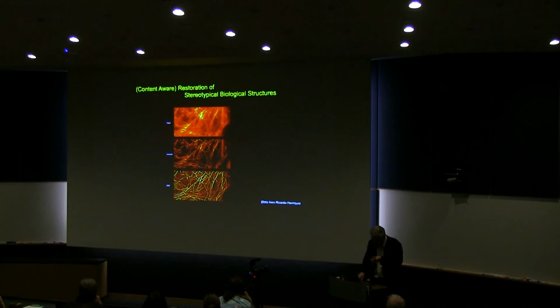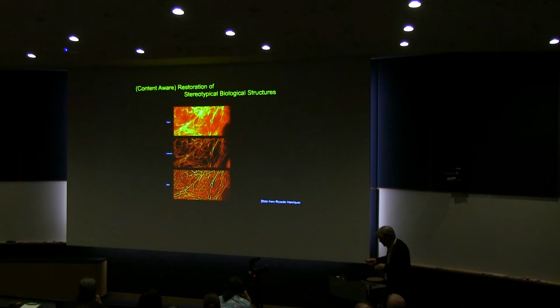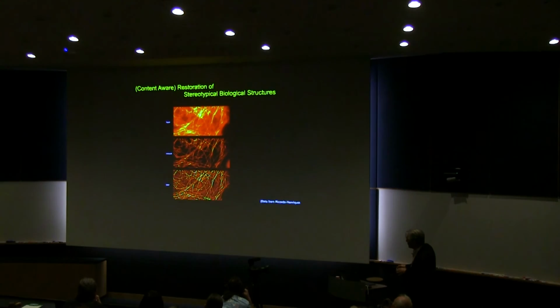And we can even do ultrastructure. This was the wide field input. This is our reconstruction, and this is the empirical observation by SRRF. But this took 20 images to produce, while this was one wide field image, okay?